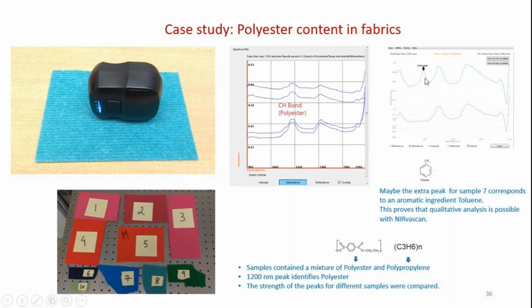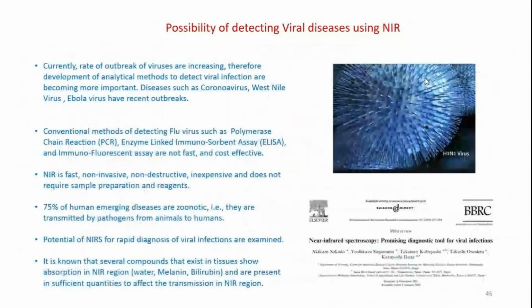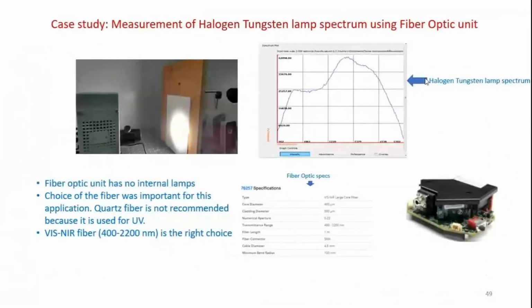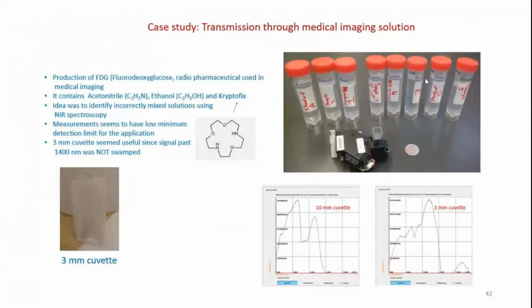So if you do a PCA model, or a LDA model, and then look at the score plot, that will show up as a different point outside the pile. You see what I mean? It will be separated from the others, and then you would know there's something different about that. Got it. Okay.